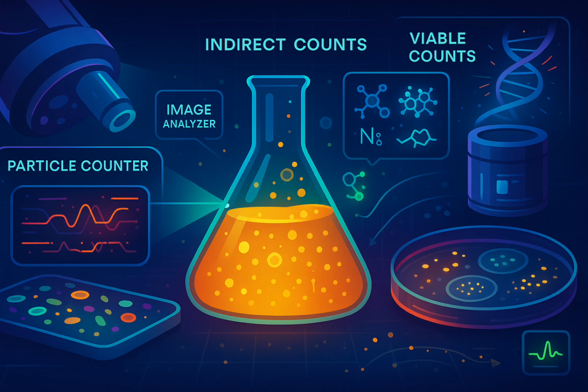Oh, plenty. Getting an even spread on that slide is tricky. You have to count lots of squares and average it, which gets tedious fast. I bet. Debris in the sample looks a lot like cells sometimes. Very small bacteria are hard to spot, especially unstained. And the moving ones? Yeah, motile bacteria are a nightmare. You often have to add chemicals like formaldehyde or methylene blue just to stop them swimming around so you can count them. It's labor intensive if you have lots of samples. Okay, so manual counting is slow and fiddly for big jobs.